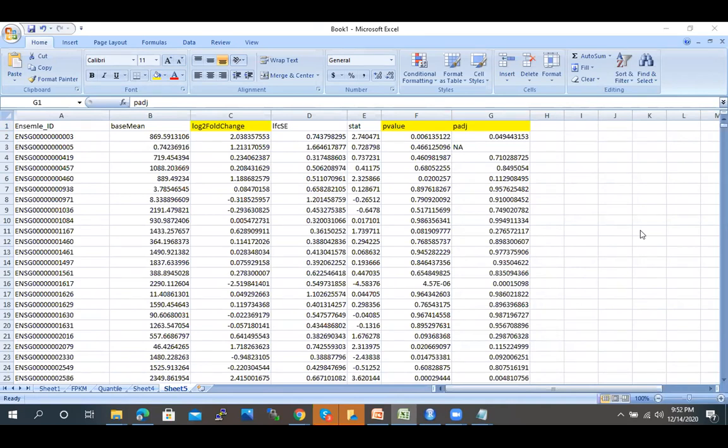So yes, it is adjusting for the different samples when we have multiple samples. If you have a large number of samples, for the multiple testing we usually consider the p adjusted value instead of the p value. This is the log fold change. This is the first output that we have obtained after running the differential DESeq pipeline.